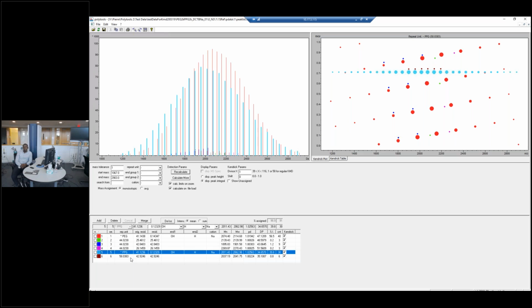Thank you. Next question. Were MS images automatically generated? I guess they came directly from the instrument in that sense. That's quite broad, but for the TLC MALDI imaging, we have dedicated software.